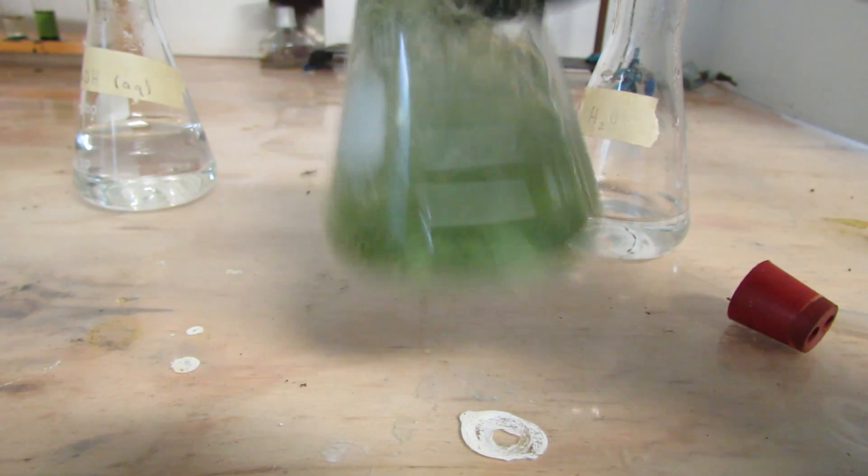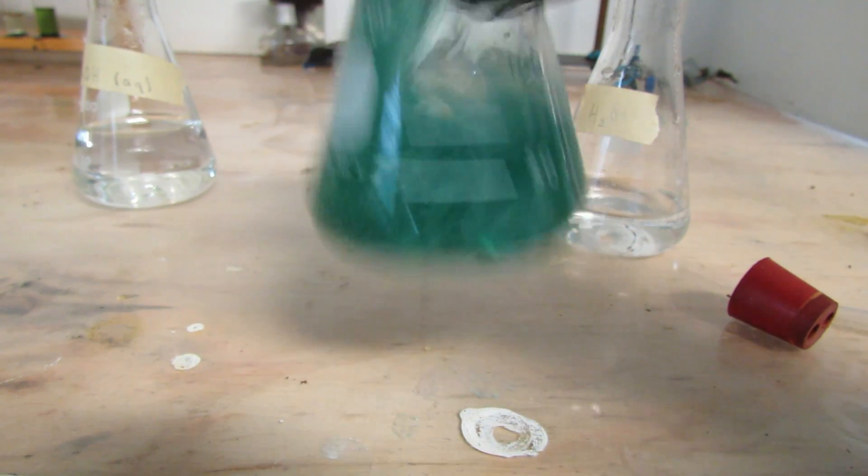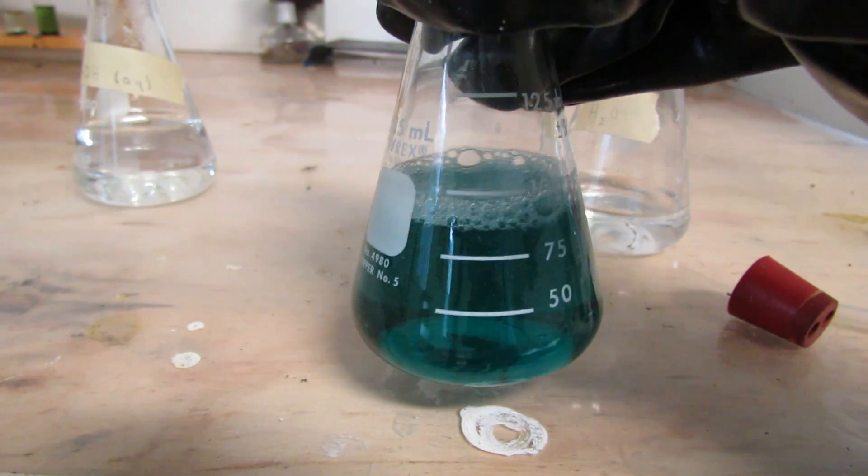So, what's happening here? The glucose in the syrup and the sodium hydroxide react and this forms the anolate of glucose.